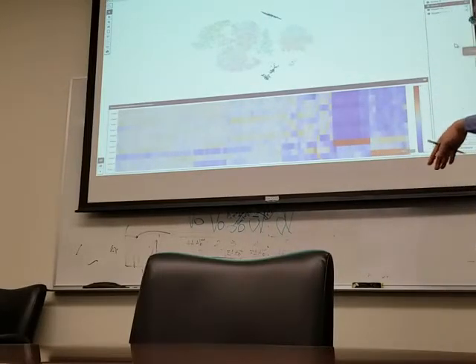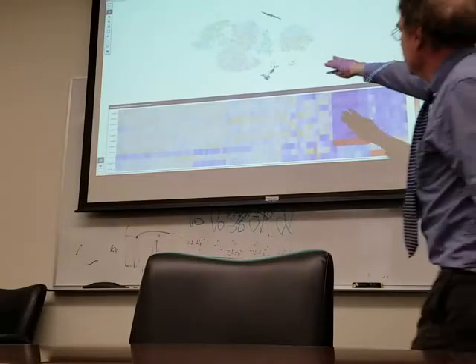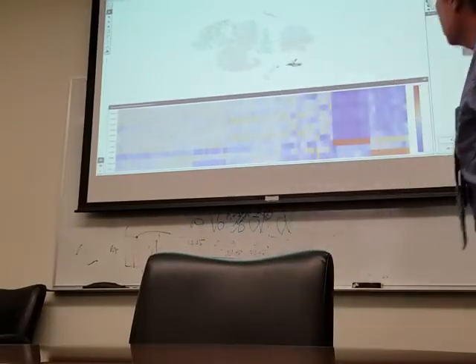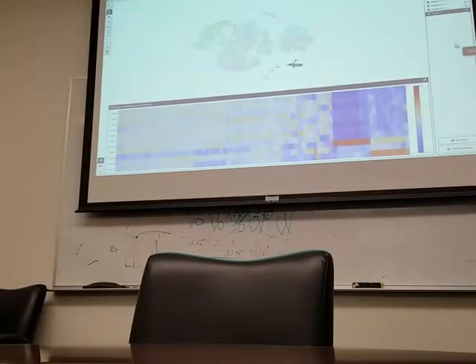And where's cluster 11 on the plot, Chris? It's probably down here, some peripheral section down here. Those are interesting, but we don't want them to show in the final plot. We want to get rid of that. If you don't have a really good sort, the different cell types are probably going to drive the most distinct clusters. It's only a few genes, but we're not interested in them right now.